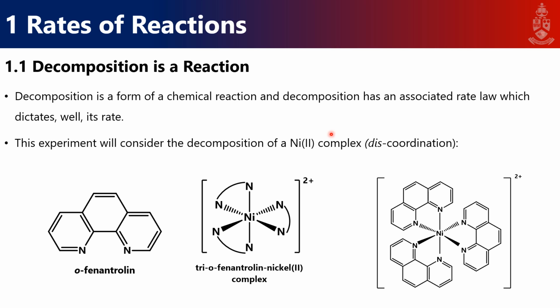The specific complex which you're going to look at is a nickel complex that is tri-coordinated to a bidentate nitrogen ligand, phenanthroline, and phenanthroline looks something like that. This is the lazy, or more cumbersome, way of drawing the nickel complex, and this is it drawn out. You can see it's quite intense. This is what we expect of you to draw if you refer to it in your report. However, it's also fine to draw it like this, since this is not CMY 385.